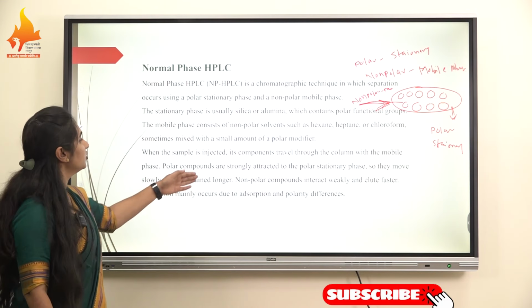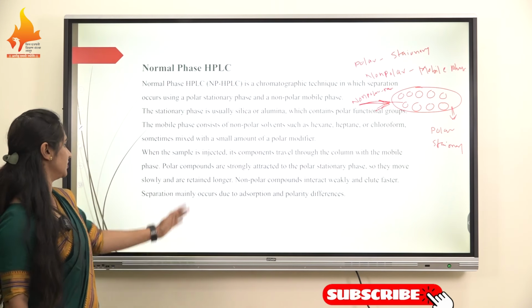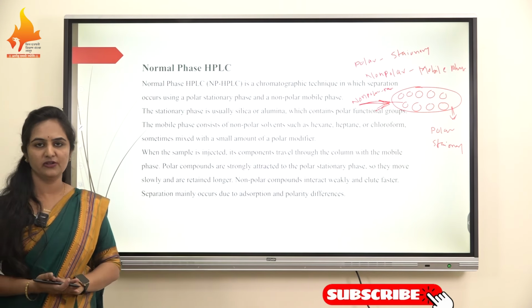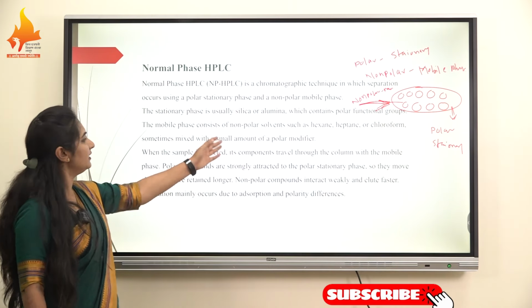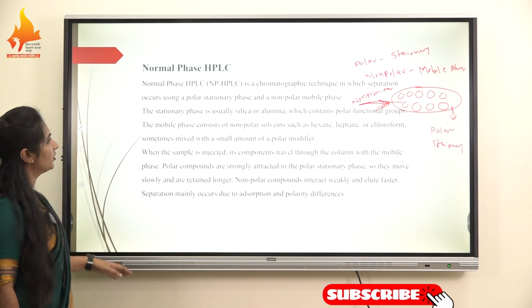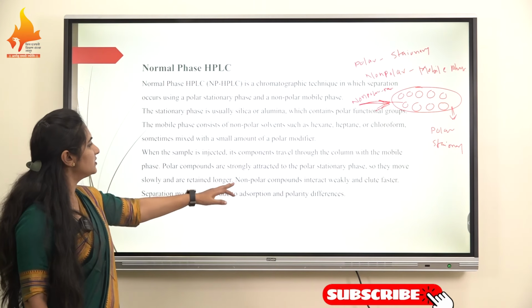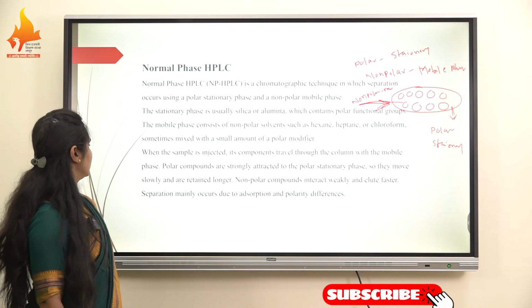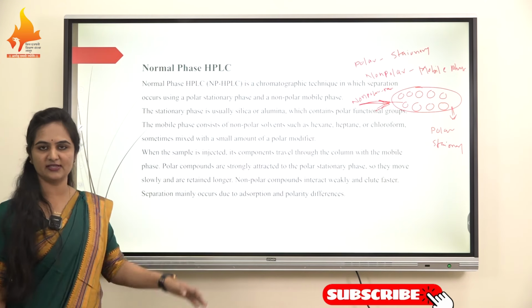The non-polar compounds interact weakly and are carried faster. The non-polar compounds present in the sample move quickly as compared to the polar compounds, because the polar phase is the stationary phase. Separation mainly occurs due to adsorption and polarity differences.